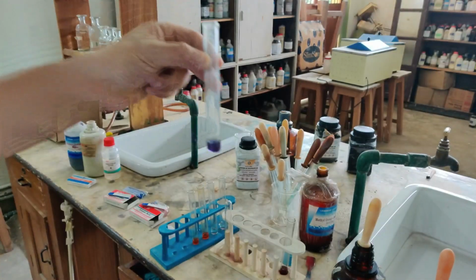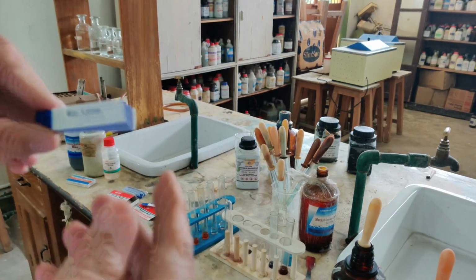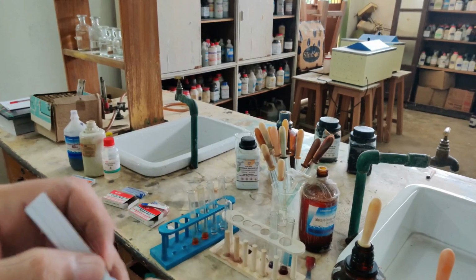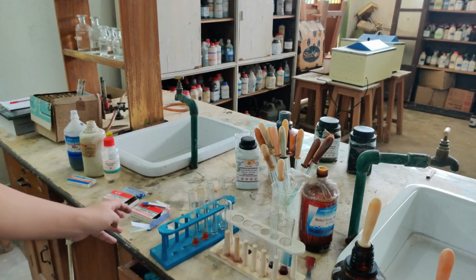Now I showed you just now with the solution, but we also discussed the paper. So let's see about the paper. Here is the litmus paper which I was talking about. This is the whole bundle of blue litmus paper. Let me take one strip. If I take one strip and test it with the acid, let's see what happens.